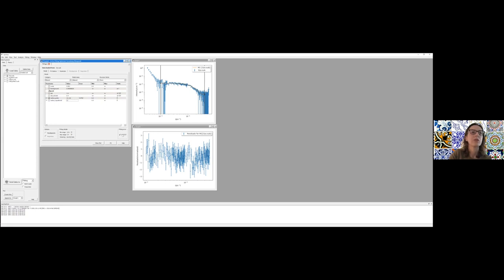And the chi-square now dropped to 0.65. Yeah, I don't get a chi-square. Do you get it here at the bottom? I don't know if you see the mouse sort of on the finger. Yeah, I don't get any number there. It's just like the line. But I can look through the tutorial maybe. Do you have an option? One of these parameters is ticked. So if no parameter is ticked, then you won't get a chi-square. I've ticked the second to last one under ellipsoid.